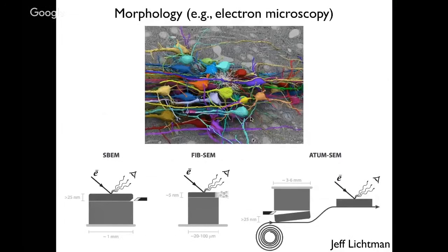So as I think some other speakers talked about, the gold standard way to look in fine detail at neural circuitry today is the electron microscope, which involves doing very fine slicing and imaging, essentially, of the morphology of neurons. So the cell membrane is typically the main thing that's labeled.